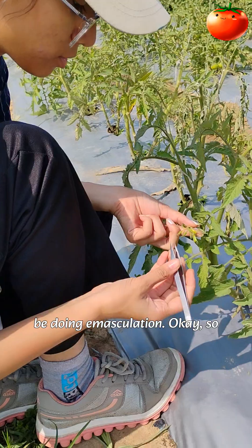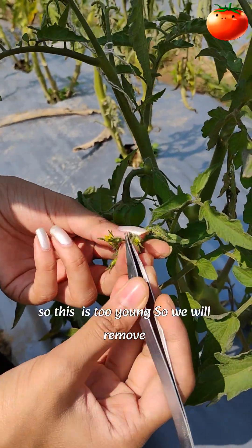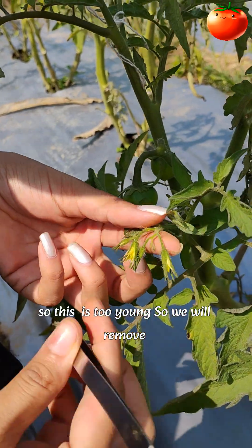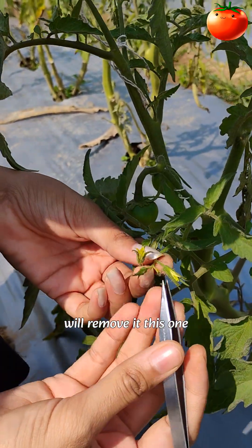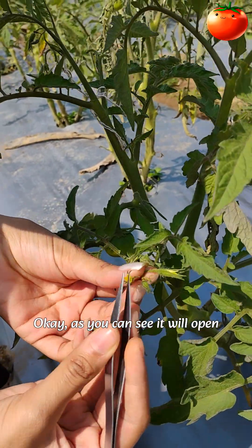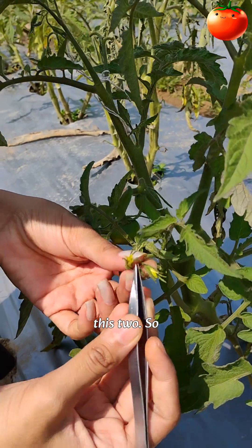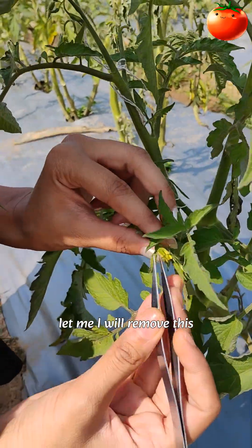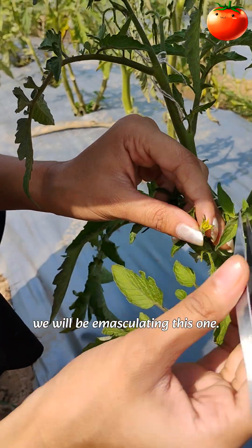So now we will be doing emasculation. For that, first we need to select the bud. This one is too young, we will remove it. This one is also too young, we will remove it. We can take these two flowers — as you can see, this one will open tomorrow. So we will select these two.